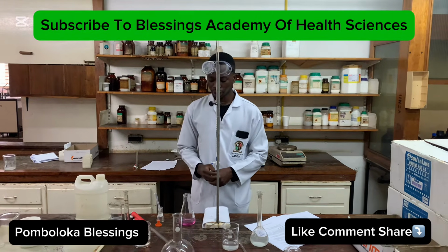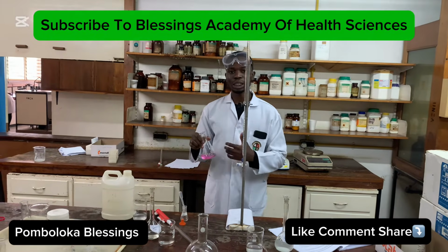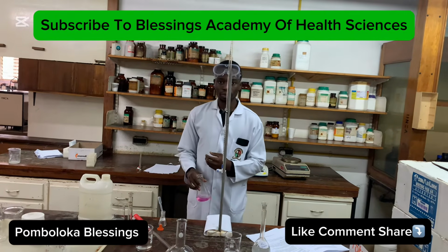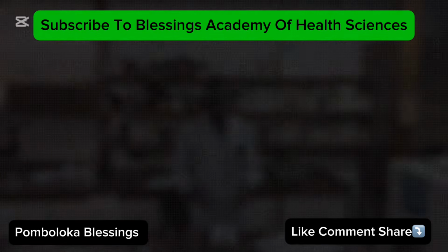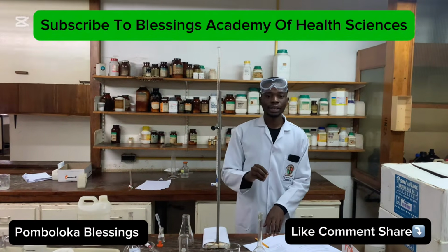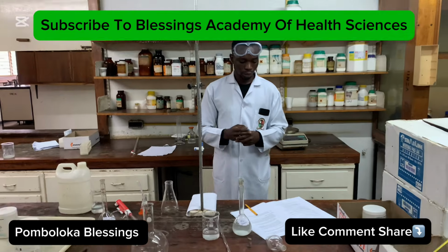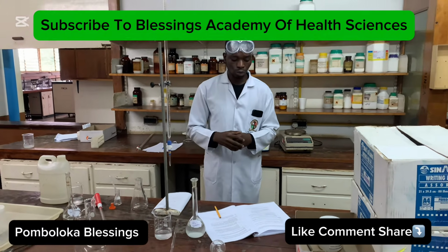We're titrating 3 times. So we again discard this, and then we titrate the second part as well as the third part. Then from there, we're going to find out the mean titer volume. So now we've done the titration. We've done the trial one, the first part, the second part, as well as the third part. So now we have certain volumes for the trial and the accurate titrations.